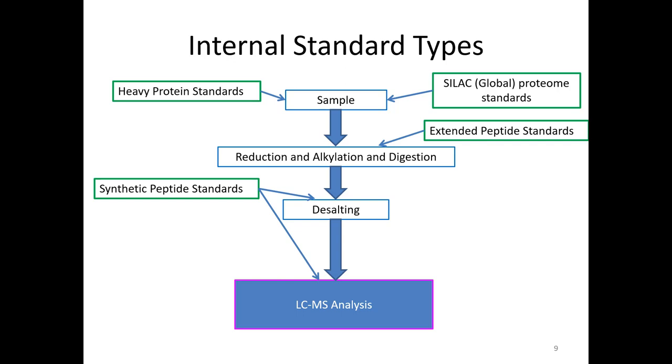This is why it's hard to get an absolute quantitation value in mass spectrometry, which is why I don't like using that word absolute. Okay. So here you can see where you would incorporate all of these things into the workflow.